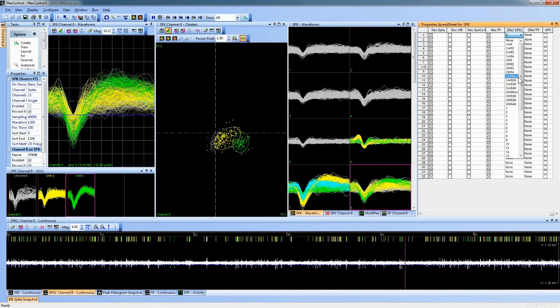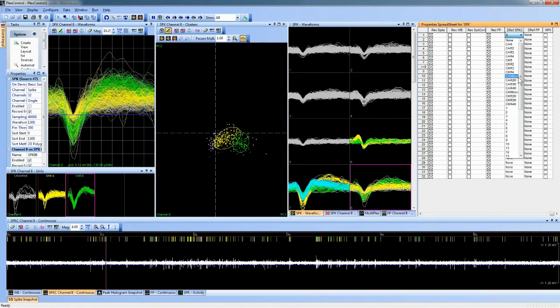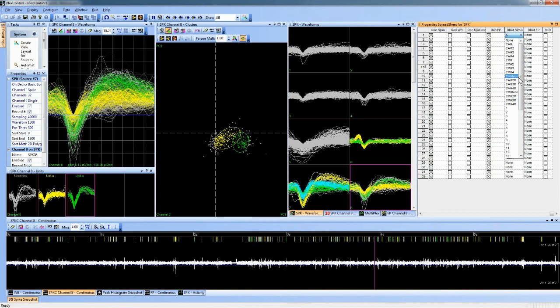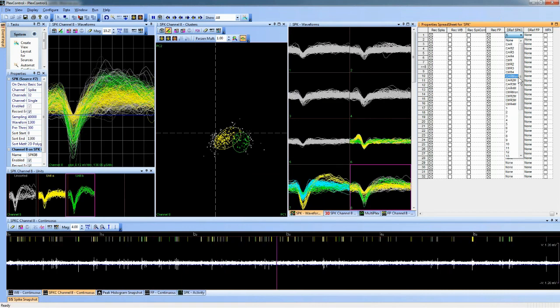We strongly recommend using a monitor channel whenever using CAR or CMR. But it's also possible then to record that channel if we wanted to visualize it or use it offline. So if we select channel 11 to be the CAR mon and we decide to save channel 11 to our data file, what will be on channel 11 then is no longer the electrode from the head stage channel 11. It's actually the average of the channels that we had set to CAR. It's another good question. Perfect.